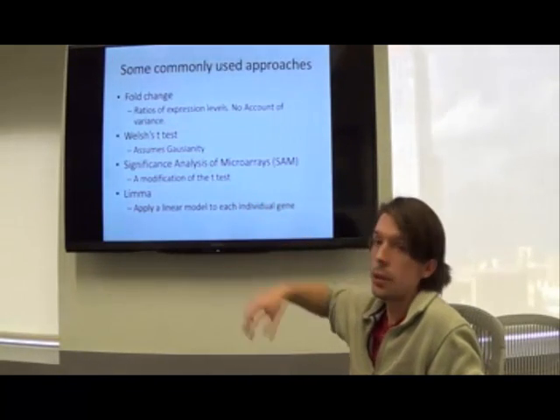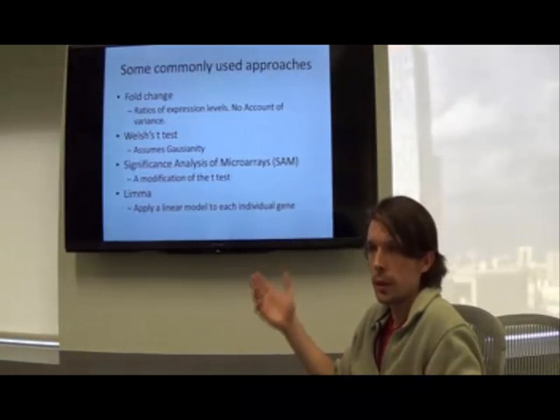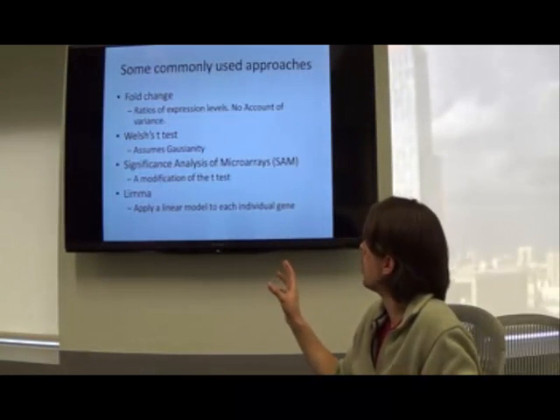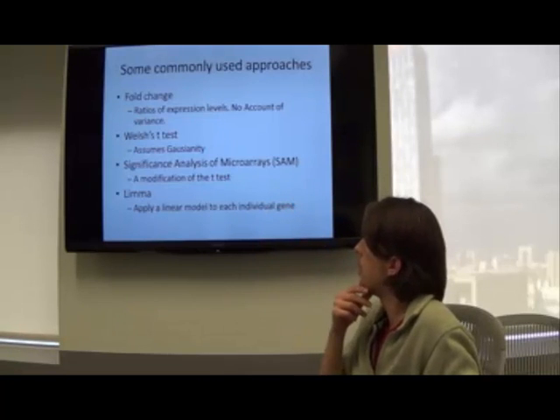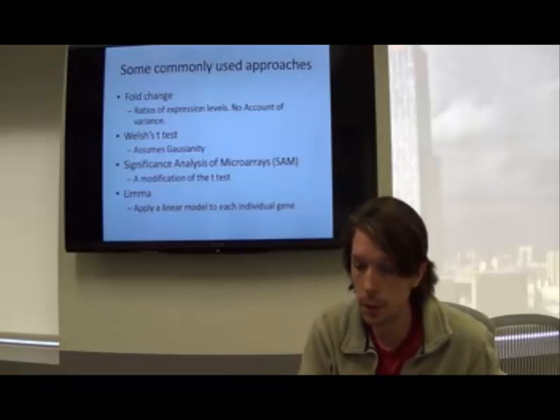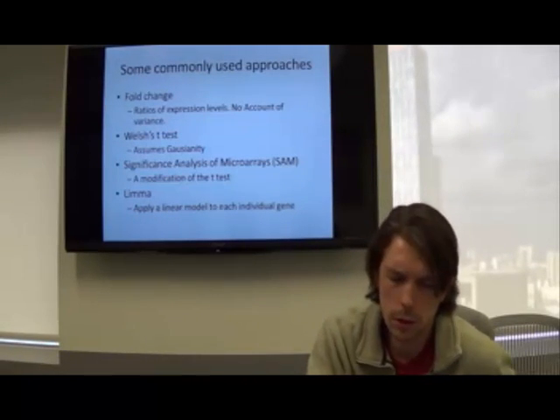And there are two other methods that are a bit more detailed, which you'll find in Bioconductor or things like this. They're used very commonly. Significance analysis of microarrays and LIMMA. You can read about them if you like. These are perhaps the most commonly used methods.